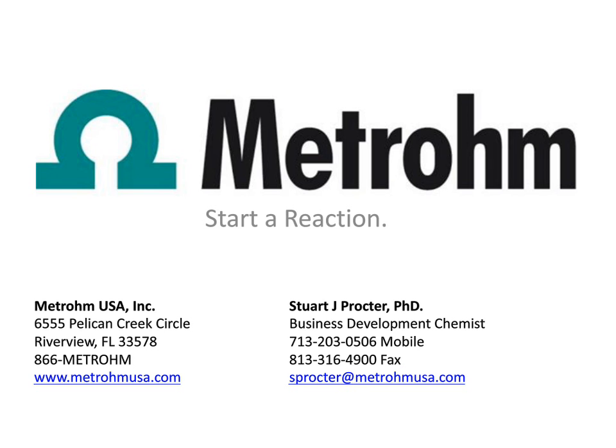Many of the methods you're describing appear to use very small sample volumes. Is this sort of a current trend for sample prep, and is that affecting the approaches that are taken? This is Joni. I think, and this is just my response to that, if you can work with smaller samples, smaller volumes, it's easier. That actually lends itself very nicely to automation, which takes a lot of the variability out of the manual workings.